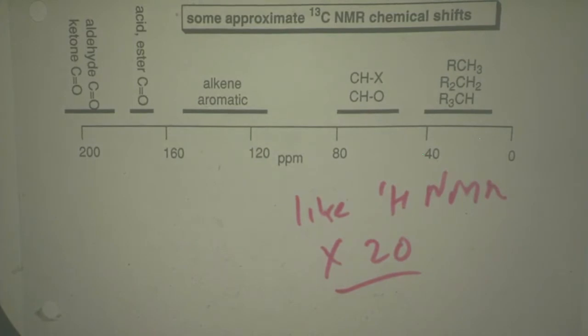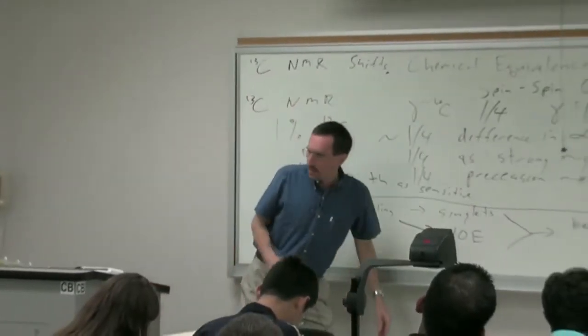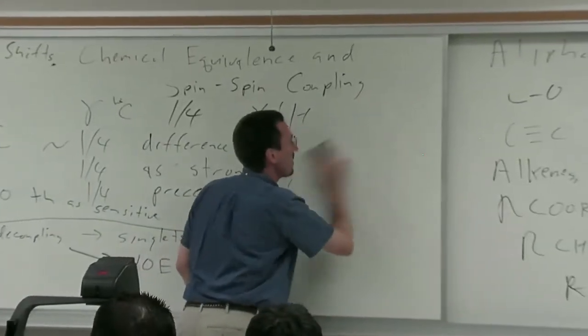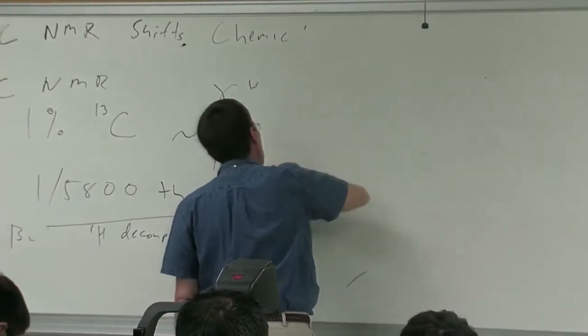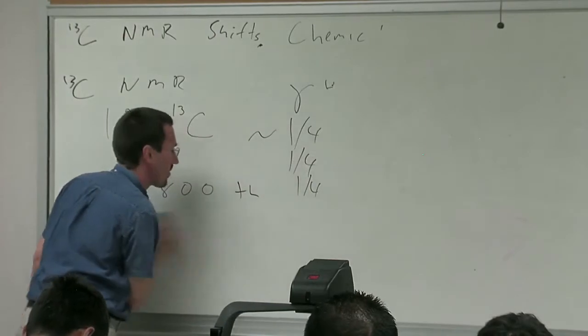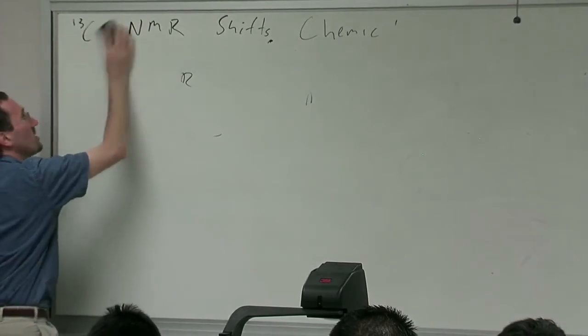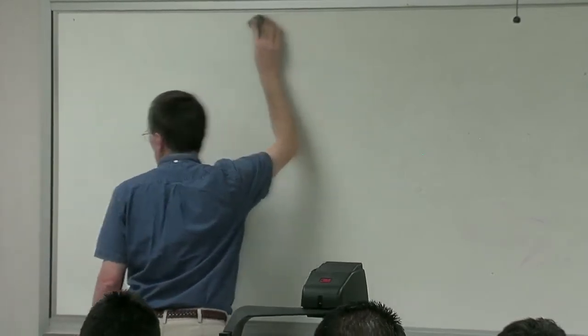All right, this should give you the basics to start to use carbon NMR in helping to analyze some of the homework sets that we're going to get. So one thing that you can get is a reading of things like carbonyl groups in there. And another thing you'll be able to do is count up and see how many different types of atoms, because whereas in proton NMR you may have overlapping resonances, most often because the carbon spectrum is more dispersed and peaks typically show up as singlets, most often you will be able to see one peak for each type of carbon.